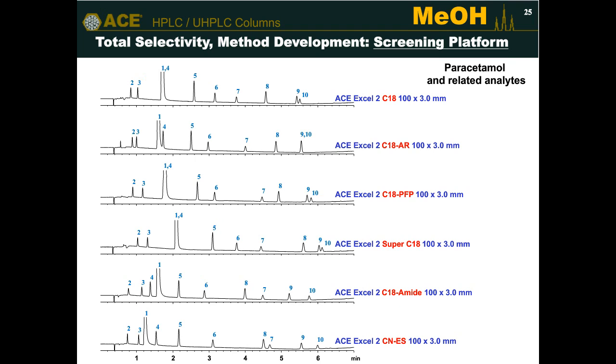So if you don't have MS, which many labs don't, and I didn't for many years, we use peak area to try and track our peaks across different chromatograms. But in an ideal world, you would use UV absorption spectra if you have diode array detection, but ideally you use LC-UV-MS, UV and MS in series. You build a picture around the UV data, the absorption spectrum, the peak area, and of course the MS data. That's always helpful, because then you can track your peaks as they move around the chromatogram depending on the different conditions you're using.